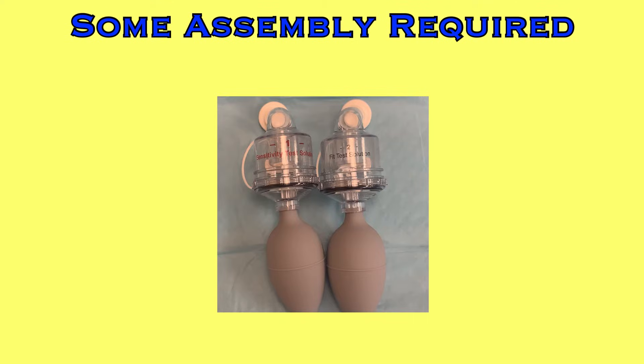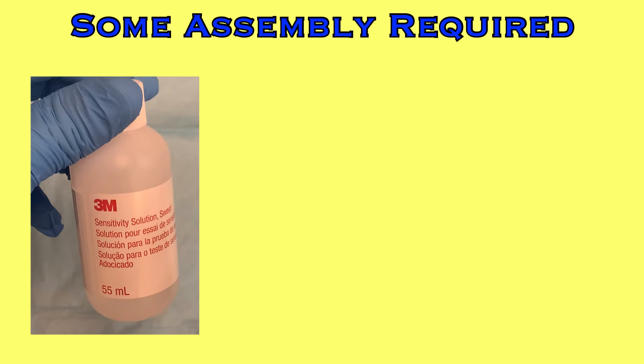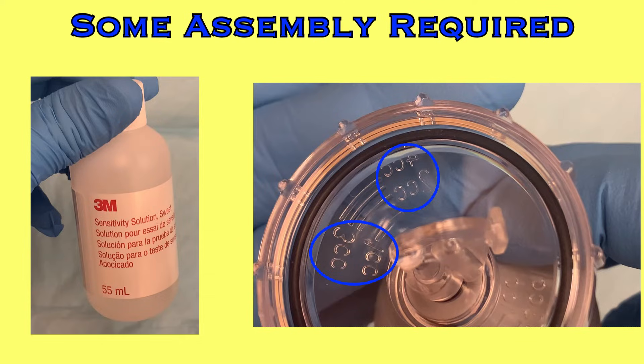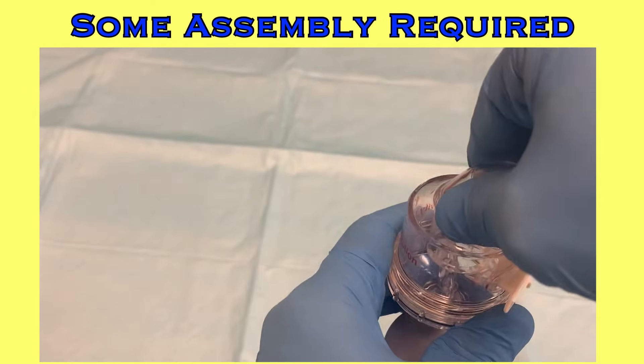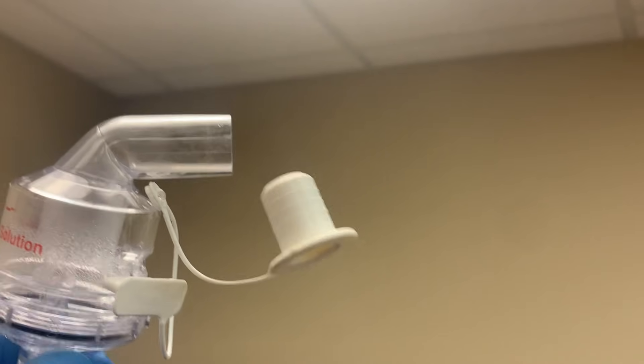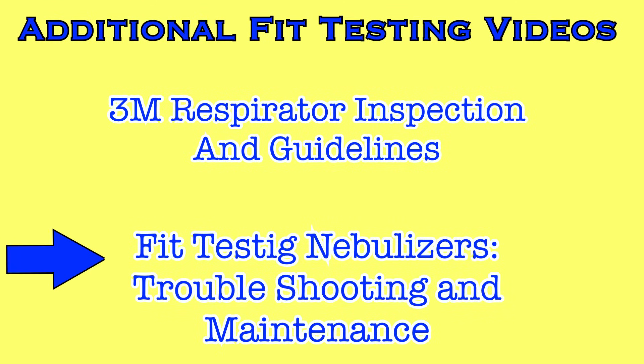Next, take out your nebulizers. They function identically, but the tops should have colored writing — one with red and the other with black — indicating either the red sensitivity solution or the black fit testing solution. Take the red sensitivity solution and fill the base of one of the nebulizers. A little goes a long way. It holds a maximum of four milliliters, but you won't need that much unless fit testing a large number of people. Screw on the top with red writing, open both ports by pulling the white plugs out, then hold the nebulizer in front of a light source and squeeze it. You should see a cloud of solution exiting the tube. If you don't, the nebulizer isn't working properly. See the nebulizer video for assistance.